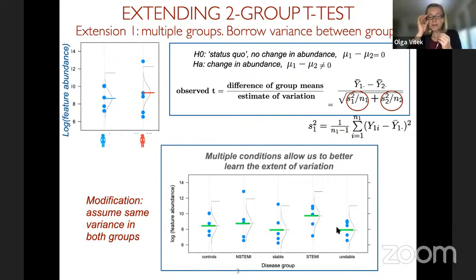And so the question was whether MSstats or MSstatsTMT can fit this type of models. The answer is yes, but only when it is appropriate for the experimental design. So we will need to see whether the experiment contains more than 2 groups. We also need to see whether all of these observations in each group can be assumed independent.